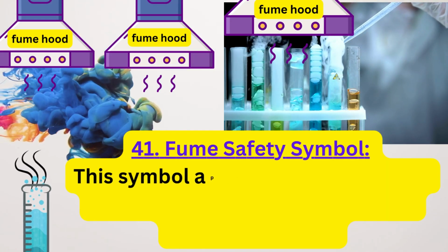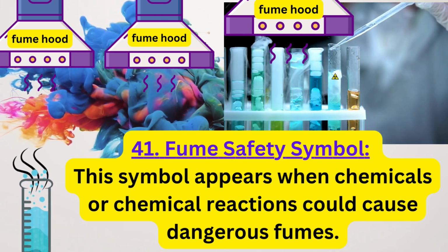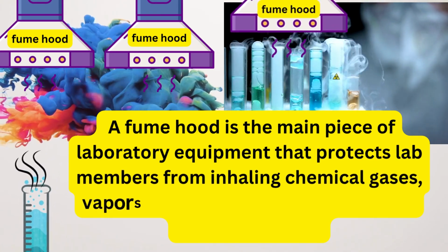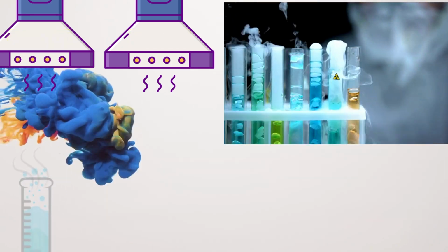41. Fume safety symbol. This symbol appears when chemicals or chemical reactions could cause dangerous fumes. A fume hood is the main piece of laboratory equipment that protects lab members from inhaling chemical gases, vapors, and aerosols of the dangerous chemical fumes.